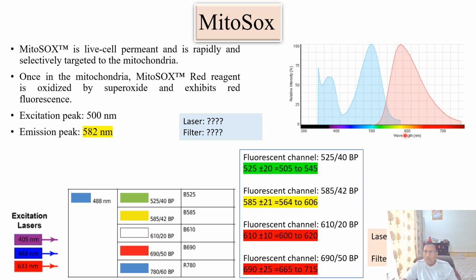You can see here that light emitted at just under 600 nanometers will have the maximum intensity, the maximum luminescence, the brightest light. So when selecting the emission and excitation, we focus on the peak.